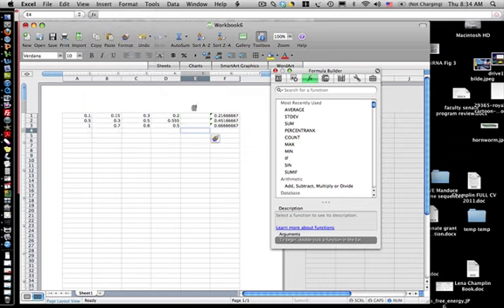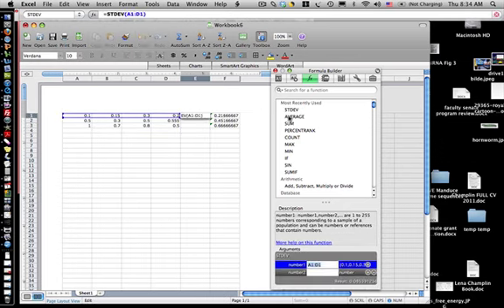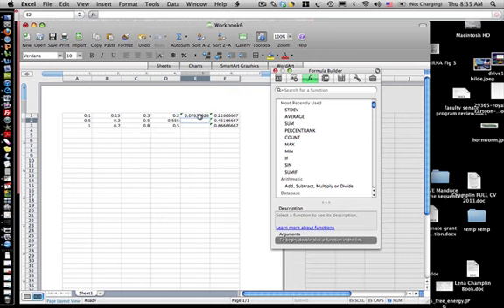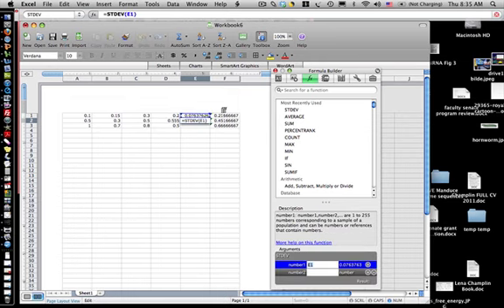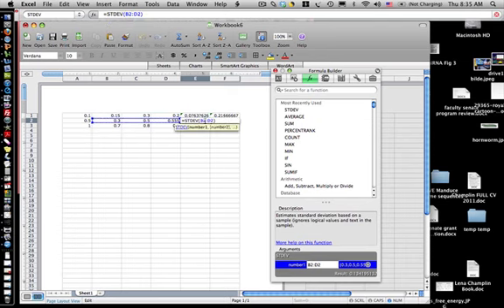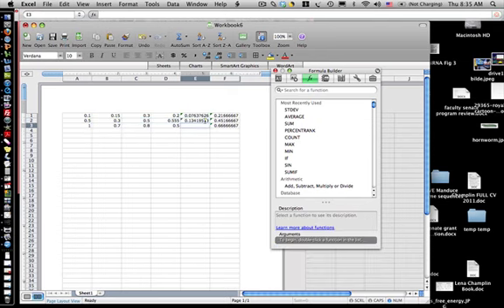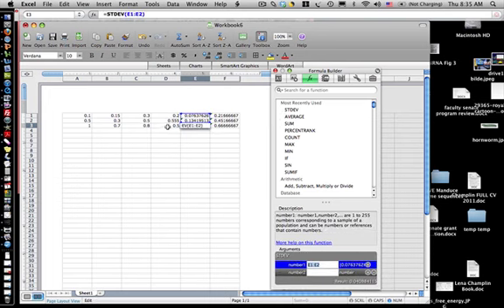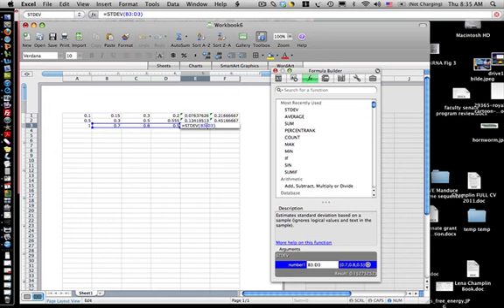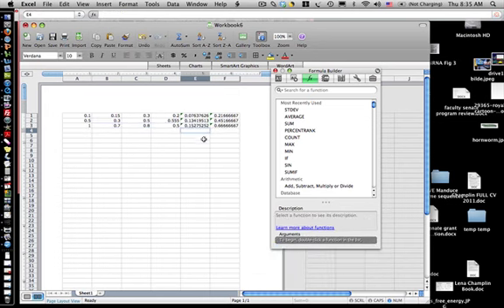Because now we're going to calculate the standard deviation of each of these values. So I can go to here, calculate the standard deviation again, highlight what I want it to calculate, and it'll calculate the standard deviation. I can go and do that again here and calculate the standard deviation for this, and then go here and calculate the standard deviation for this. And we'll use those values later.